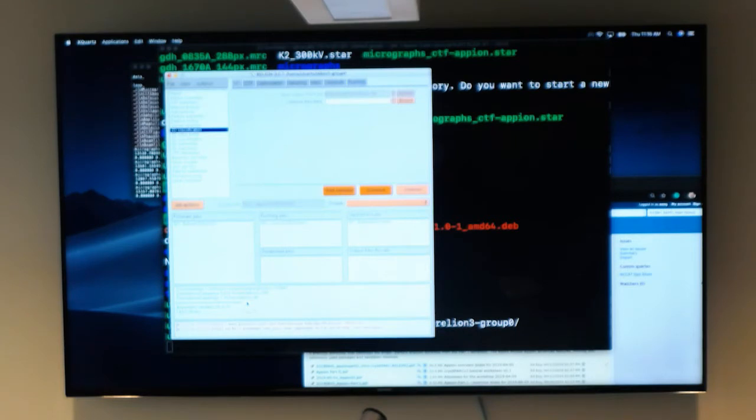Okay, so then let's click on that job and go through the tabs. Okay, using the extract folder, great. Optimization, great.